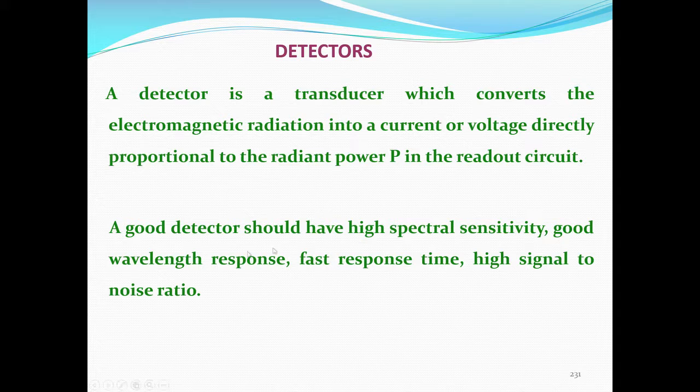The aim of all detectors is basically to generate signals which have a very stable current with the reference, and of course with the sample also, but given the optics and detectors, the noise will be essentially the same for a blank reference as well as the actual sample.